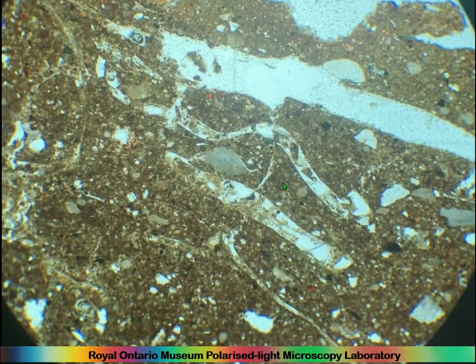So, and it might be useful at some stage for someone to actually write a doctoral thesis on plant fiber voids, of which we get a lot in the prehistory of the Middle East. But all we can really do at the moment is say, well, this is clearly some sort of plant fiber void, and see that it is distinct from another one, because it doesn't look the same. But what would be really cool is if somebody actually went and tempered lots of pottery with lots of different plant fibers and see what they look like in thin section, experimental archaeology basically, and see what sort of plant fibers create different things.